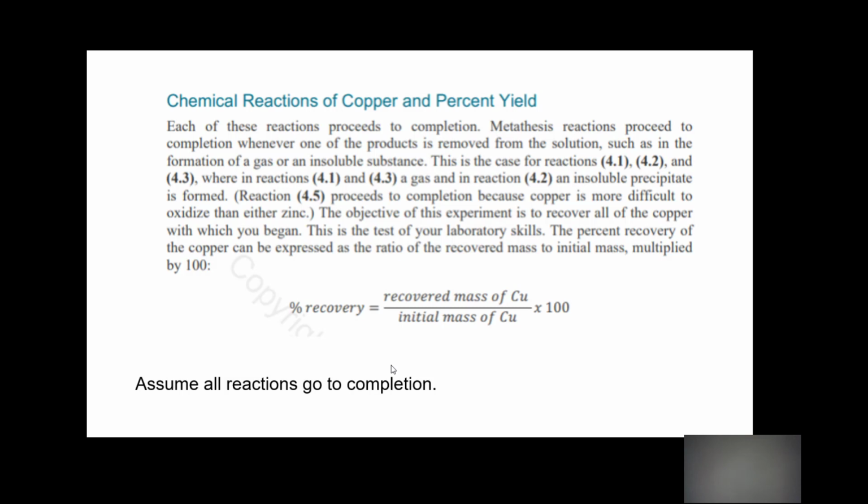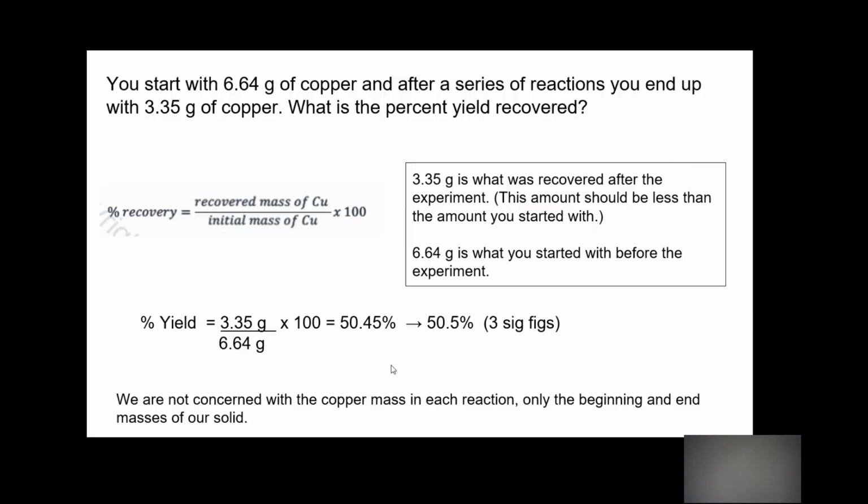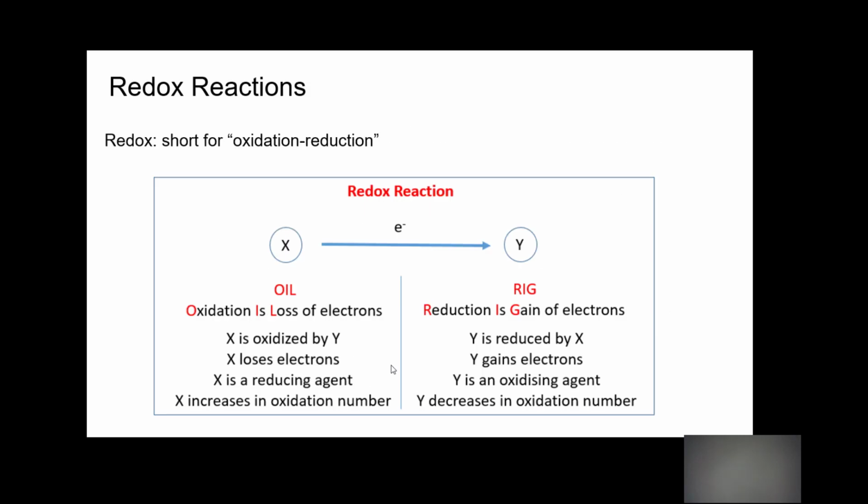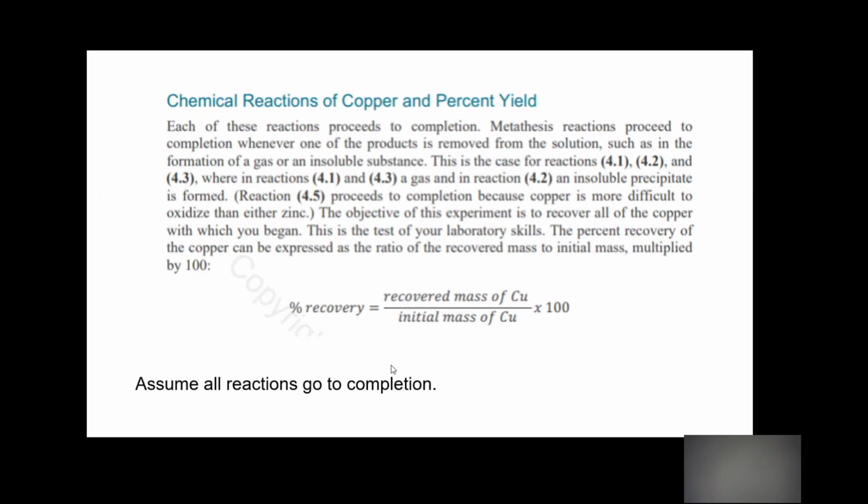I copied this from your PDF. You definitely should make sure you understand this. The equations in parentheses match up with the equations they're talking about. So I would definitely say you should write down some of this to keep notes on, to make sure you're comfortable understanding. This is a hard one because unless you're in lab, it's really hard to visualize what's going on. And if you have very little experience in the lab, this makes it 10 times harder to really understand this lab.